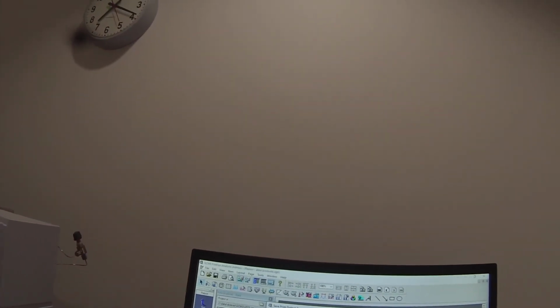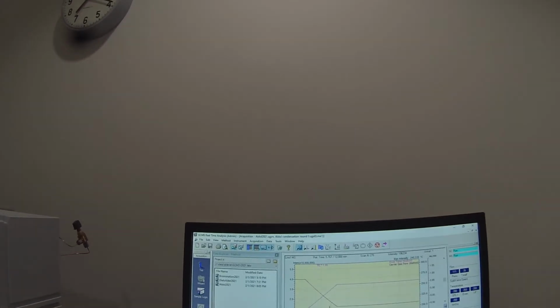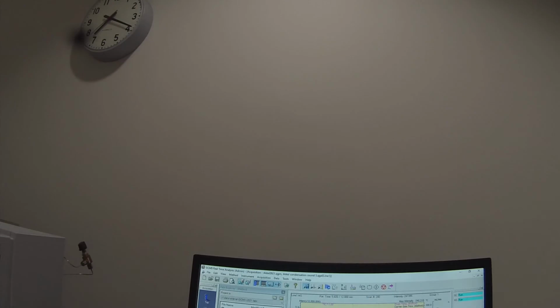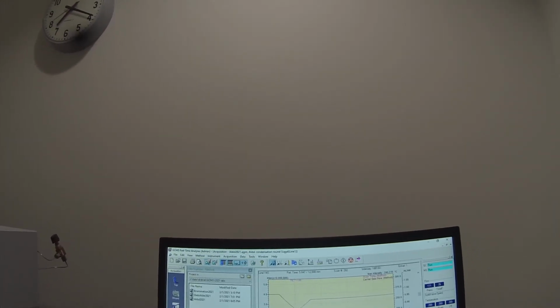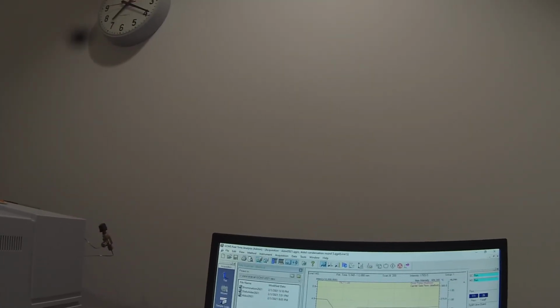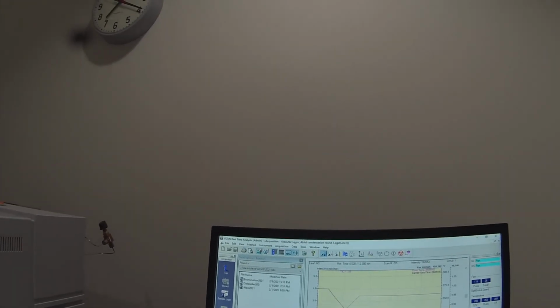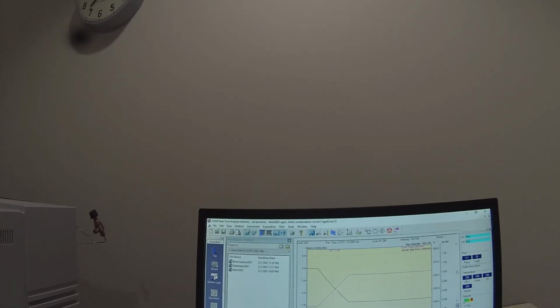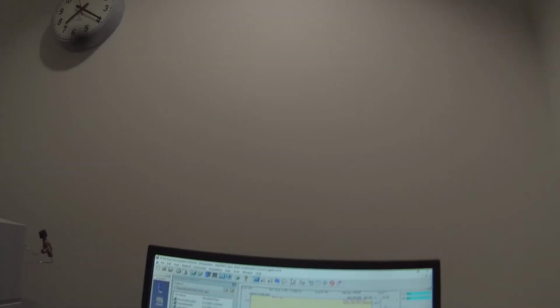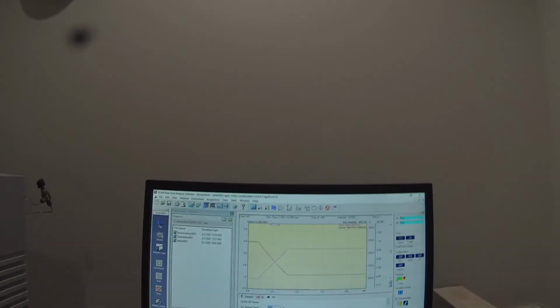Aldol product K1B2. And you'll see that we can already tell that that peak is not there. Right, that peak between 2.5 and 5, not there at all. Our solvent cut time is 2 minutes, so we're not seeing anything. So that peak was in fact a carryover. So I'll run this and then I'll print it into that same report form, and that's what I'll upload. And that's it for now.